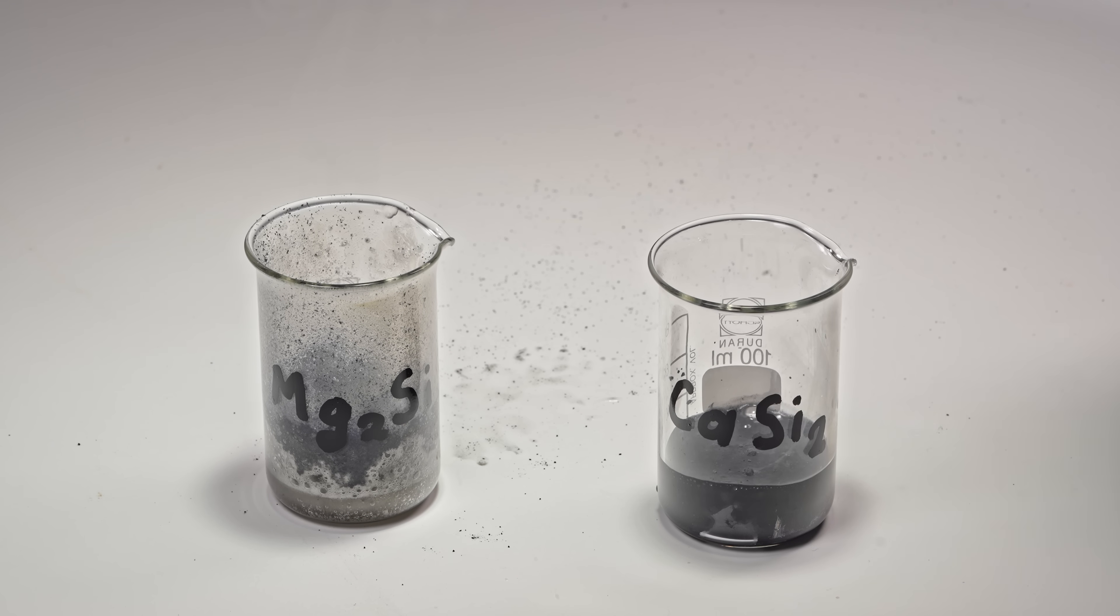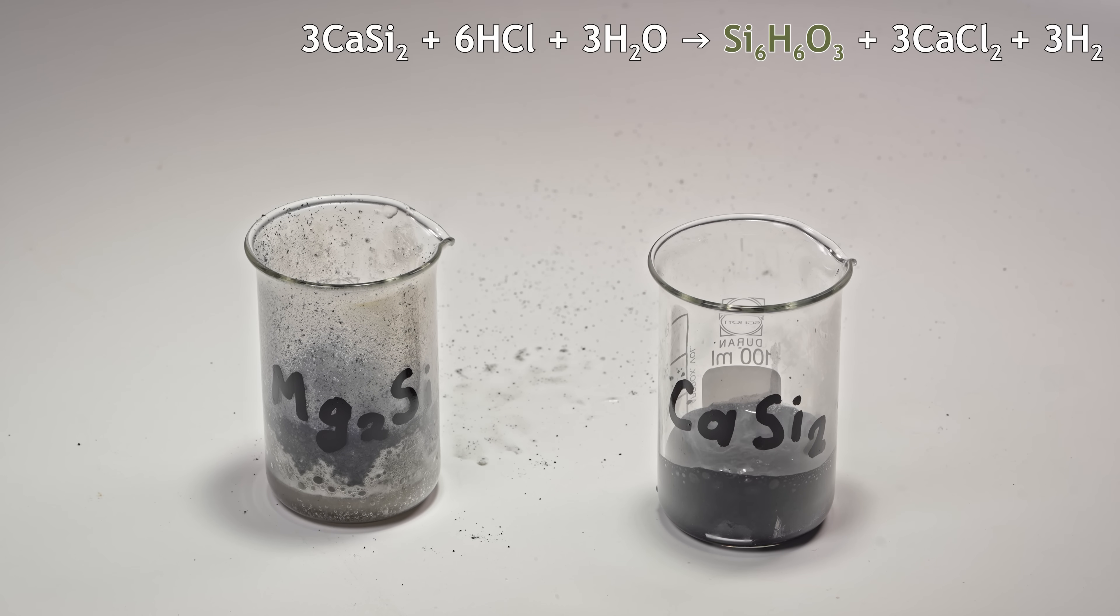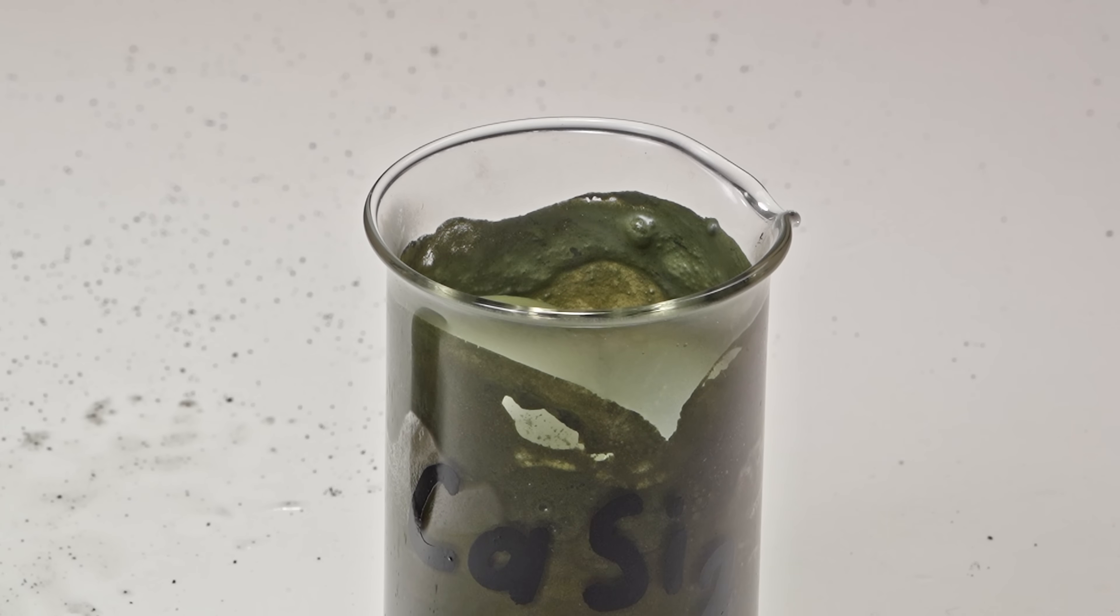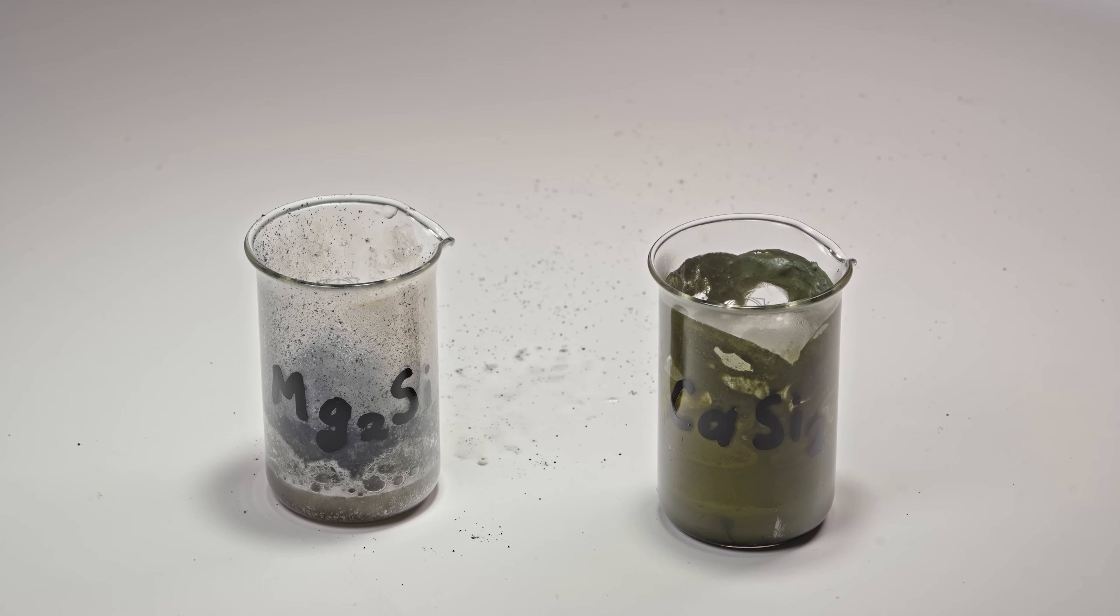Instead of silane, it just releases some hydrogen, which is not very active. Still, the green stuff we get from this reaction is really cool, and you probably didn't know about it. It's called siloxin. Let's synthesize it.